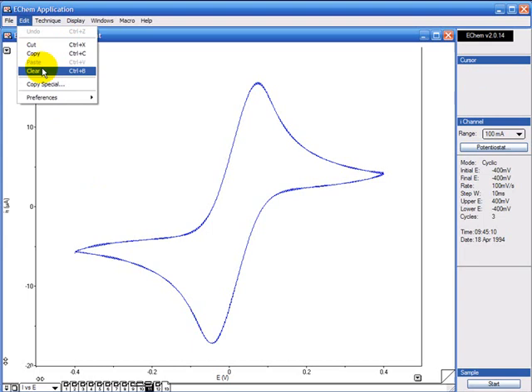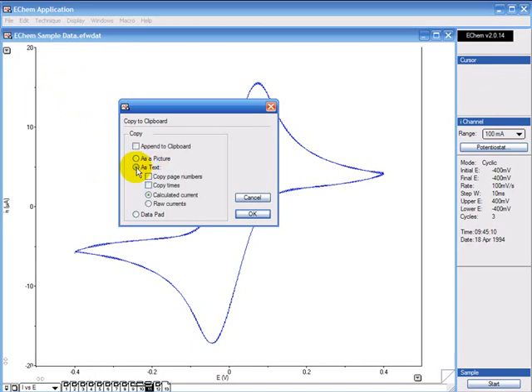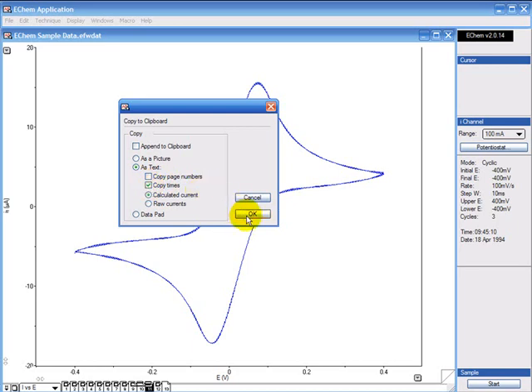In the menu Edit, choose Copy Special and you have a choice of copying as a picture or copying as text. If you choose As Text, you can include the times, click OK.